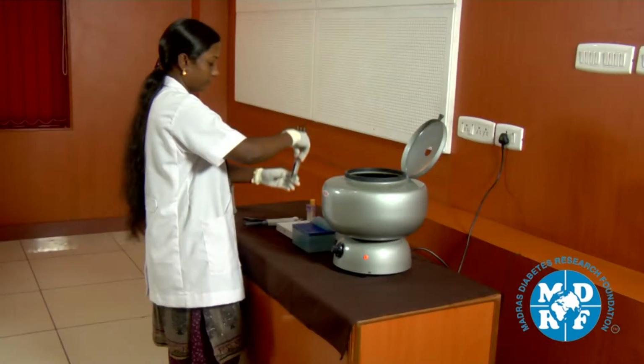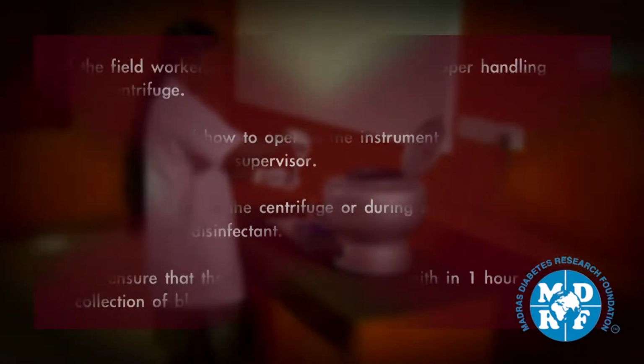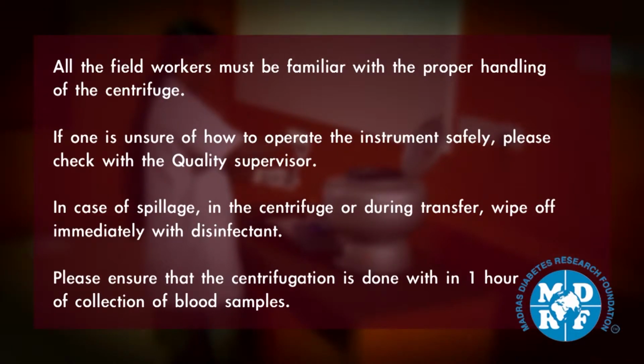Wear protective gloves and lab coat while handling the centrifuge. All the field workers must be familiar with the proper handling of the centrifuge. If one is unsure of how to operate the instrument safely, please check with a quality supervisor. In case of spillage in the centrifuge or during transfer, wipe off immediately with disinfectant. Please ensure that the centrifugation is done within 1 hour of collection of blood samples.